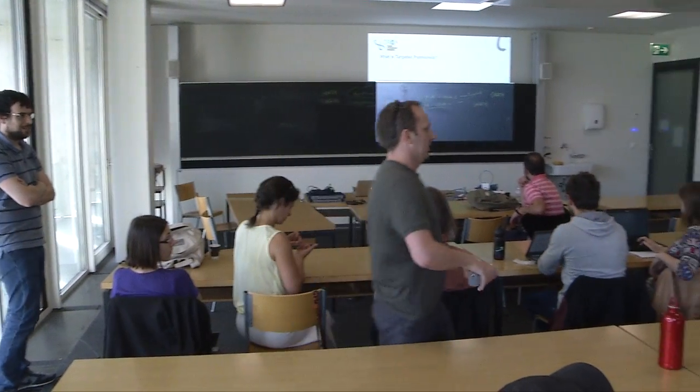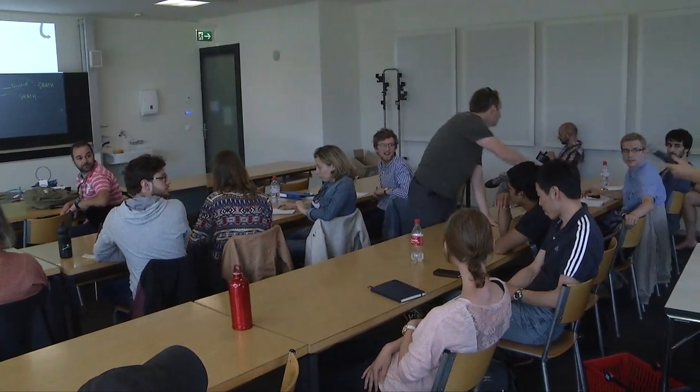Brandon. So I would say that swath and DIA, I just see them as synonyms. To me, DIA doesn't get me in any legal trouble with AB Sciex, so I just tend to use it. And I think that's the spirit in which Jarrett and pretty much everybody outside this lab, who doesn't feel like, hey, we came up with this name, uses it. What do you mean, trademarking it? I think we just have to use DIA as a synonym. So I frequently just write DIA/swath and hope that doesn't get me in trouble.